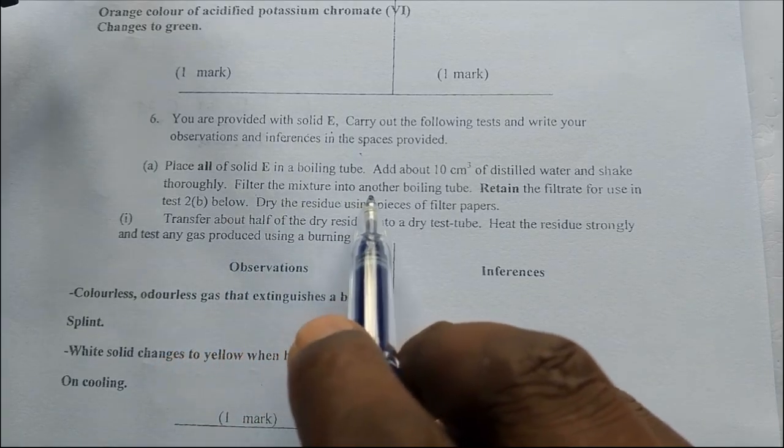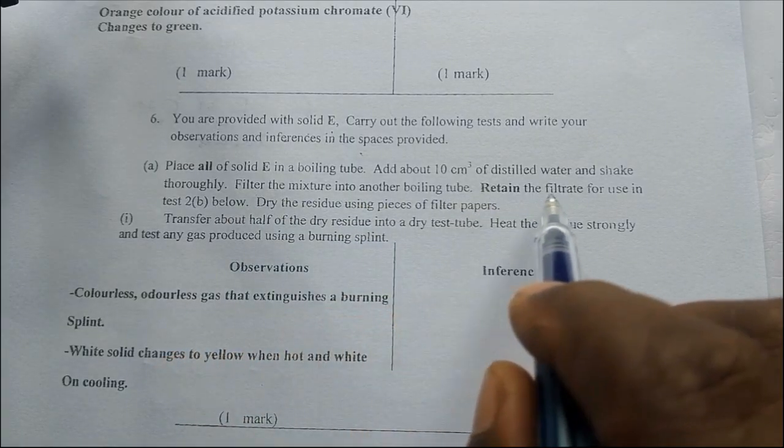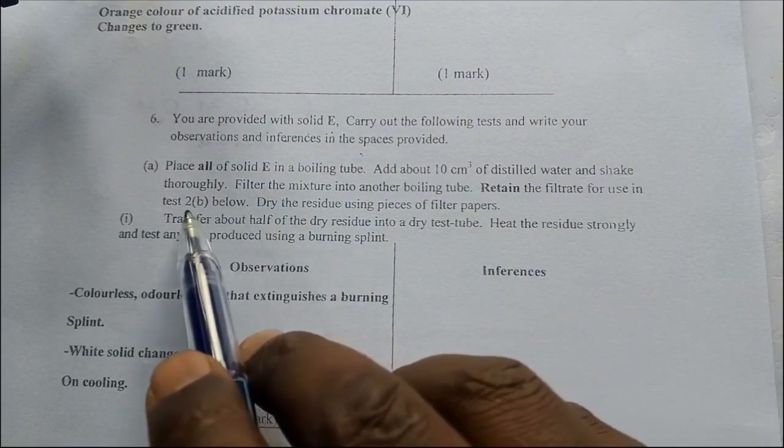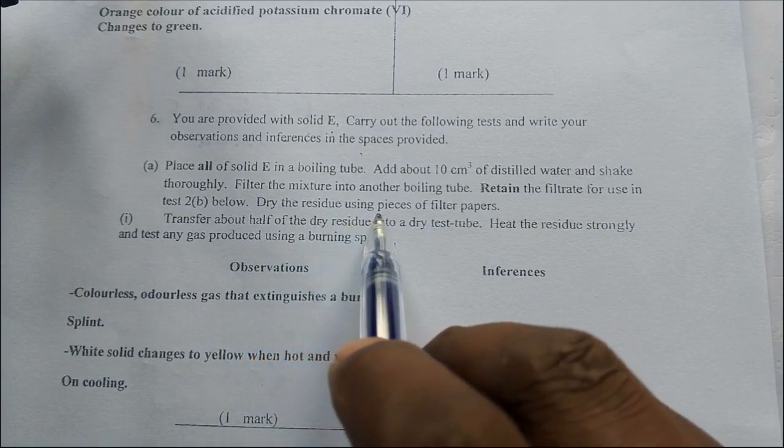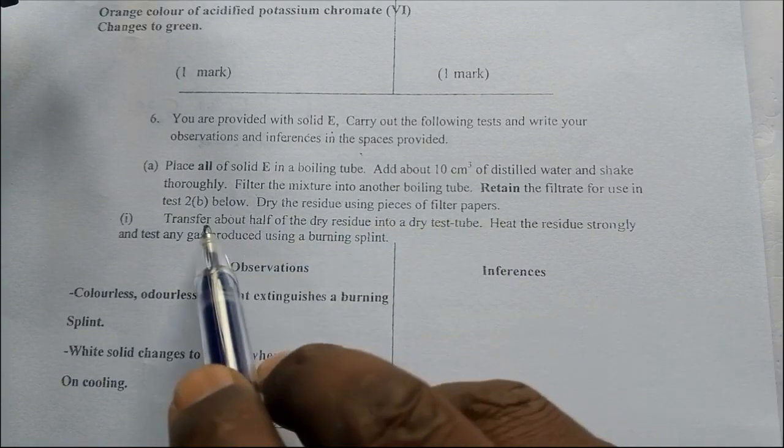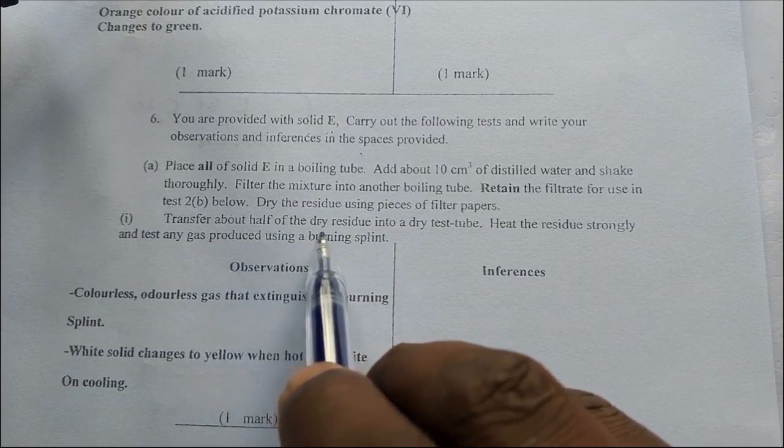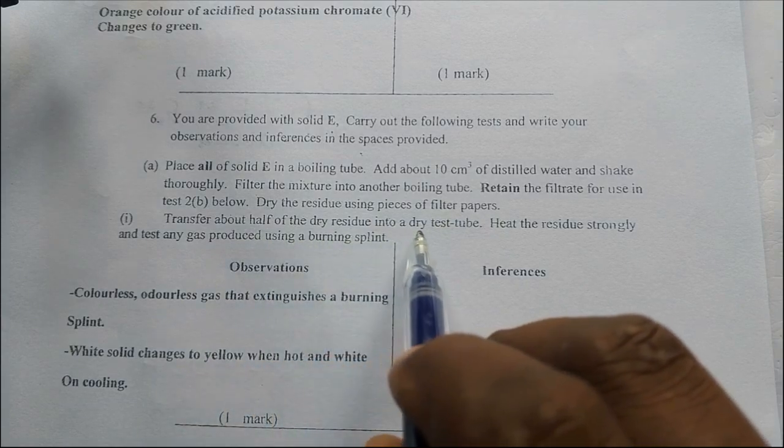Filter the mixture into another boiling tube. Retain the filtrate for use in test 2 below. Dry the residue using pieces of filter papers. Transfer about half of the dry residue into a dry test tube.